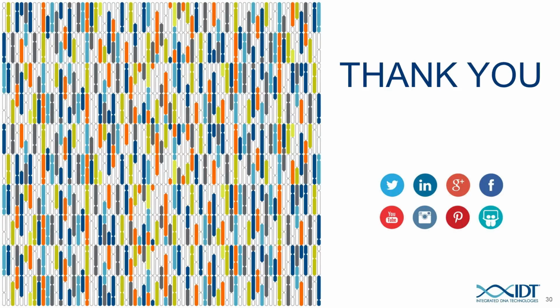A lot of things have been tested, and that's certainly something that we're interested in to help boost the rates of HDR. But it's not something that we have a clear answer on yet. So I think there are certainly some options out there. I think we haven't yet determined what other negative impacts or other risks might come along with some of those non-homologous end joining inhibitors. But yes, things certainly exist, and the most common thing is looking for small molecules that inhibit NHEJ.